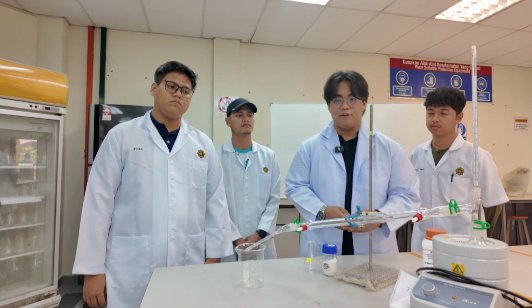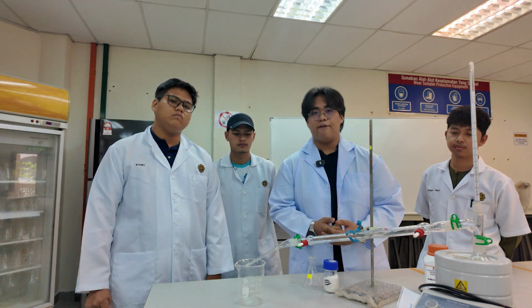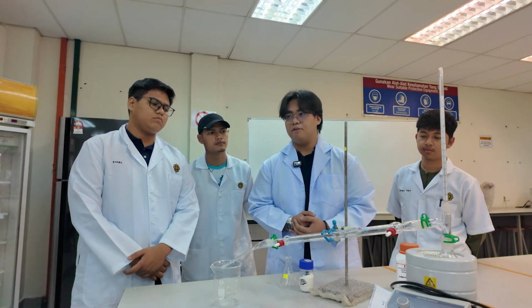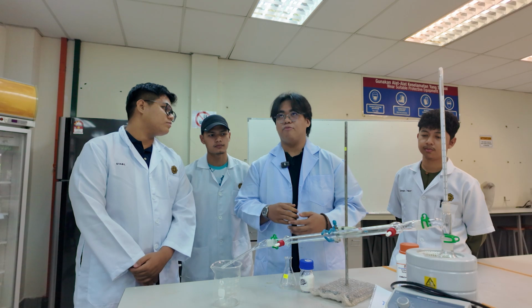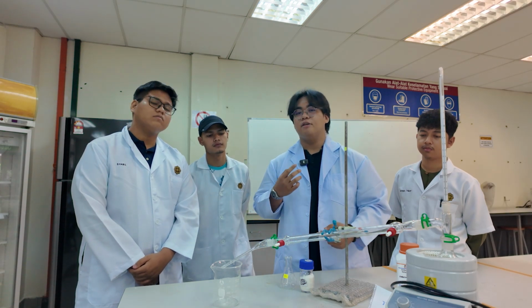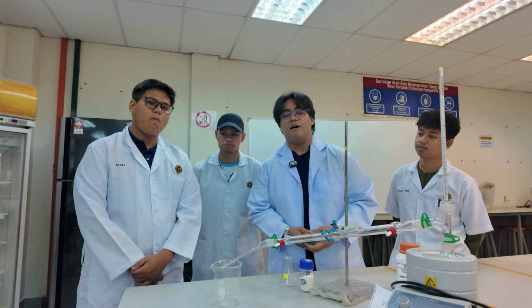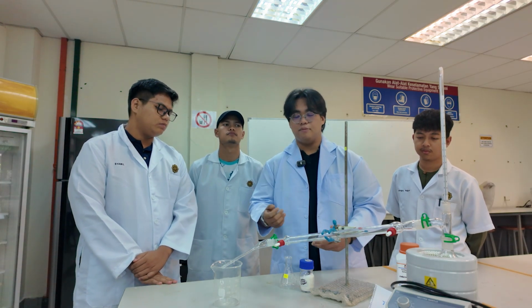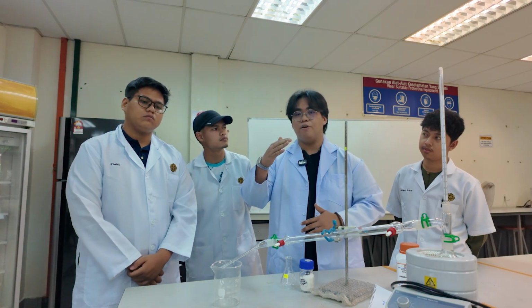So generally speaking, the process of this distillation is first we must have a mixture that has 2 compounds, and we make sure that each compound has a different boiling point. Then we must heat up the mixture to a temperature between the boiling points of each compound.